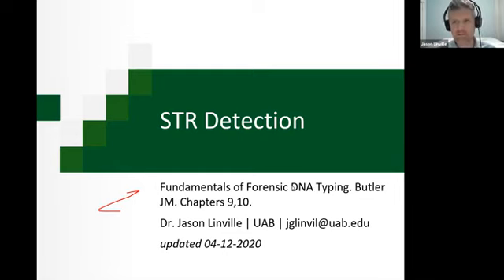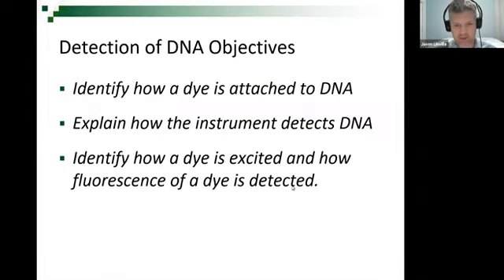So we just got done, as far as where this is in the class, talking about amplification of DNA and then how to prepare that DNA for analysis. We covered the concepts of including a size standard with every sample as it gets separated, and running an allelic ladder in addition to the size standard to help convert the time of our peaks into size in base pairs, et cetera.